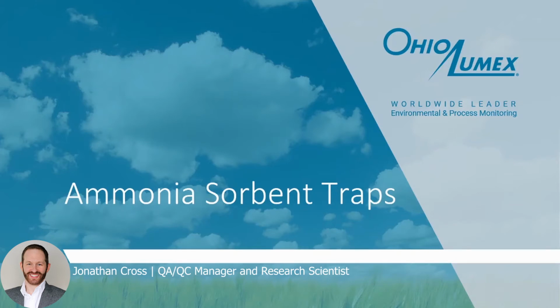In this video, I'm going to go over some of the basic elements of our ammonia sorbent traps. First, I'll lay out several of the key advantages sorbent traps have over other methods in general. Then I'll give a summary of the sampling procedure, the reasons for measuring ammonia, and briefly touch on method performance.